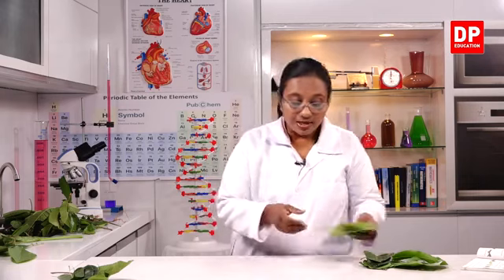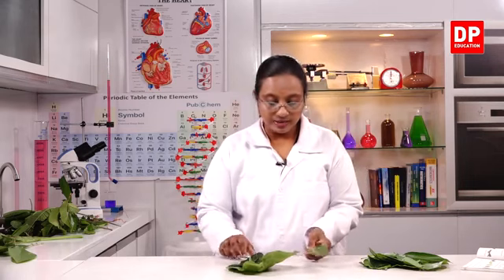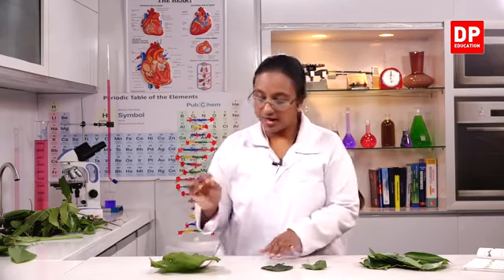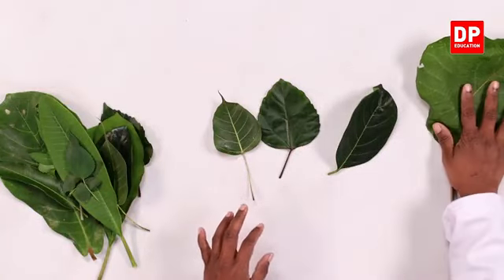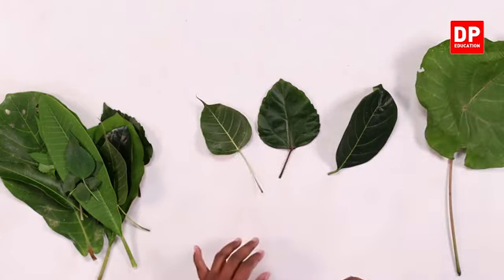So that is what you have to look for. When you look at a leaf, you have to compare. We have compared the shape of the leaf blade, the leaf tip and the leaf margin. Then what is the other part? The leaf stalk, and how that attaches with the leaf. Now here we can compare the bow leaf, the hibiscus, the jack tree, and this is another leaf. Here, similar to a lotus leaf, you can see how the stalk is attached to the leaf base.